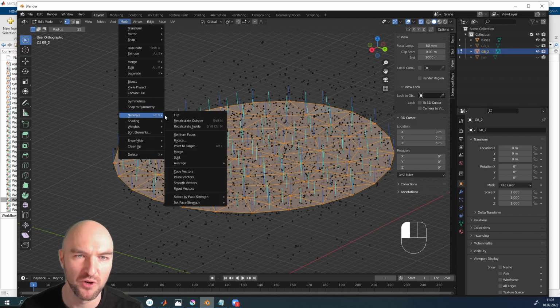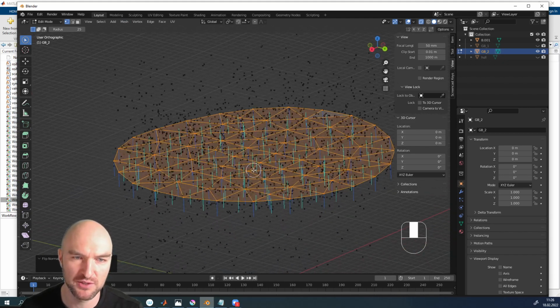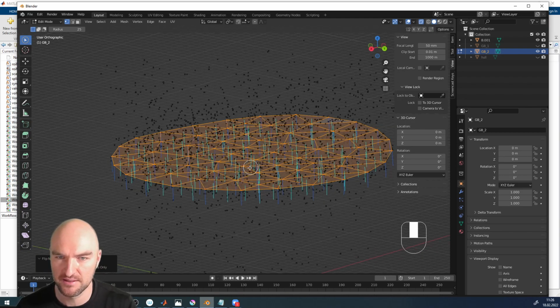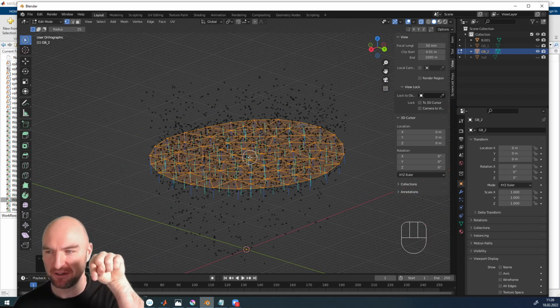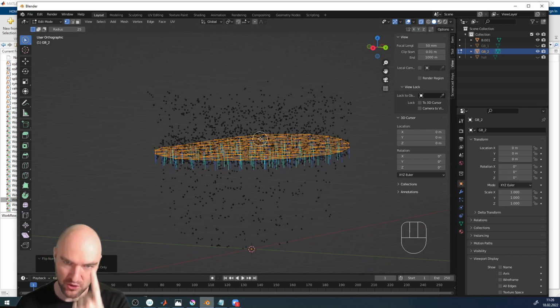Normals. You can either flip the normals, then all the normals will point into the other direction. So maybe you want to make the positive z-axis the positive direction, which we don't. We now go from the bottom of the data set from 0 up, but maybe you want to go in the other direction.